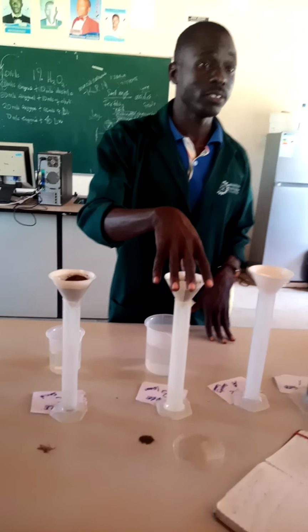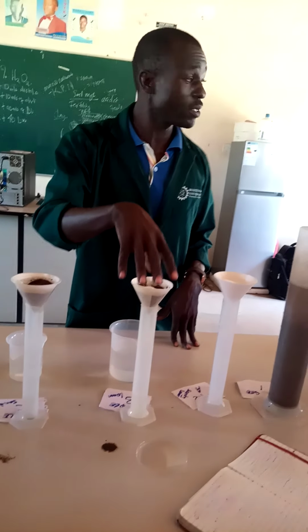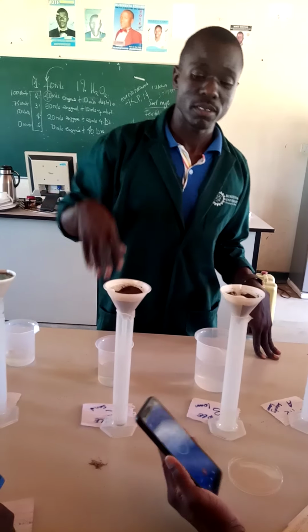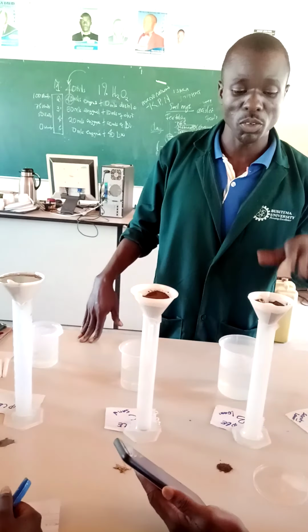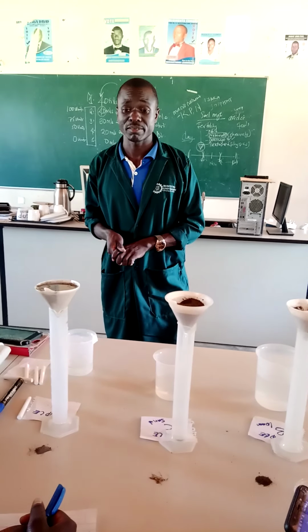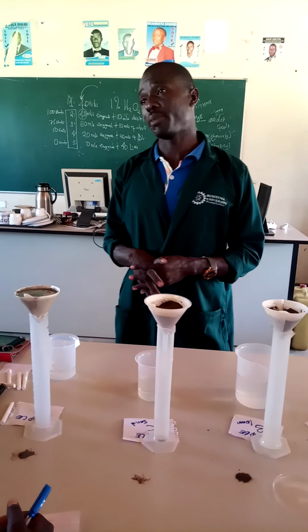What did you record for this? 8 seconds. Who recorded for this? 11 seconds and 14 microseconds. This one was 8, this was 11. And this one? 1 minute, 36 seconds, 86 microseconds. Thank you. So that is how these three soils behave.